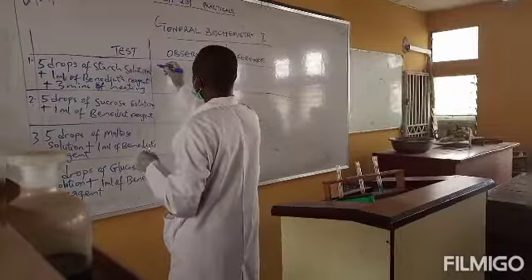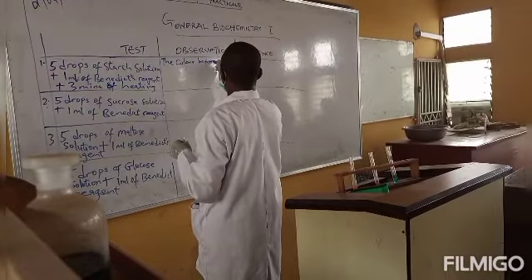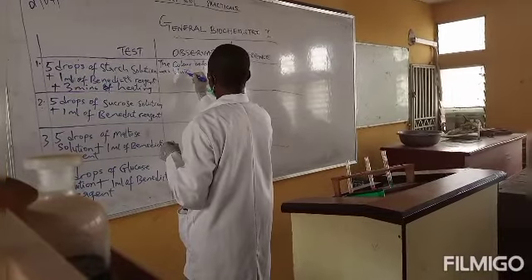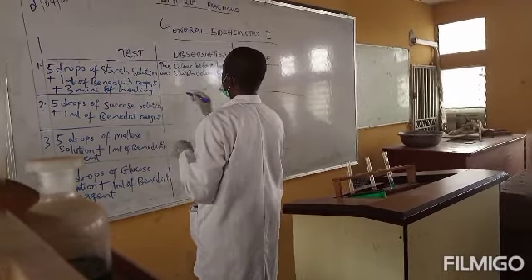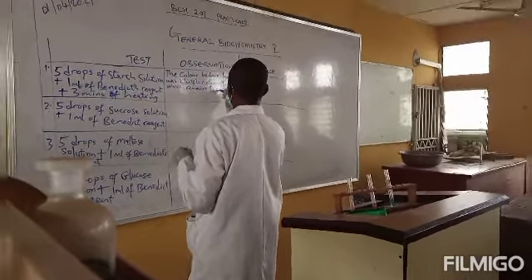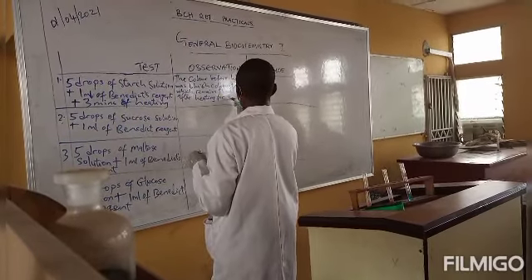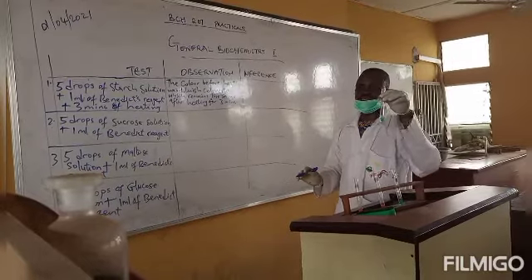You put it there that the color before heating was bluish coloration, which remained the same after heating for 3 minutes. That is our observation about the reaction.